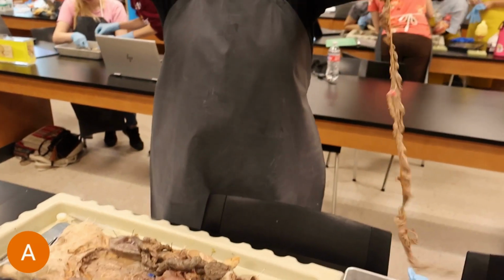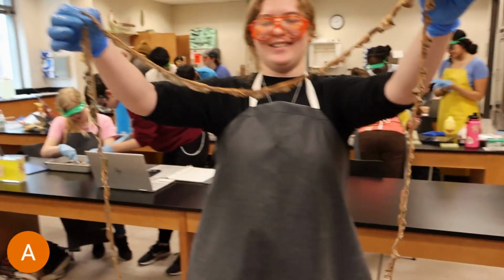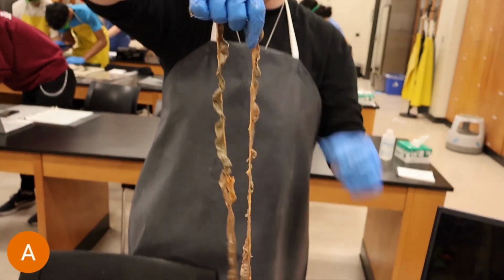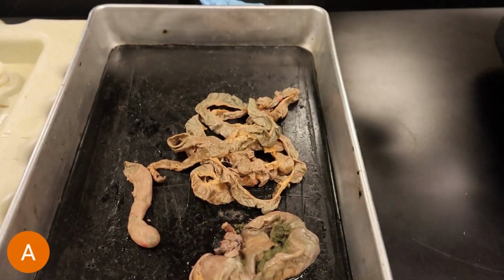Alright, so we're still covering the digestive system. So right now, this is a clip of our group member, Emily. She's going to be extending the small intestine to show you all the expanse and the size of the small intestine. And then in the next clip, she'll be cutting open the stomach while I discuss a little bit more of the adaptationary properties of the cecum.